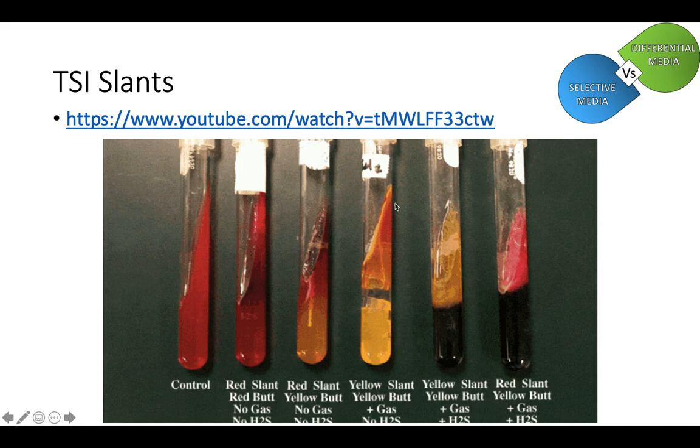So we know this particular species of bacteria is able to eat glucose as well as lactose or sucrose, which is a very interesting bit of information that you can then use to diagnose what you're looking at. So this would be reported A over A, acid over acid.